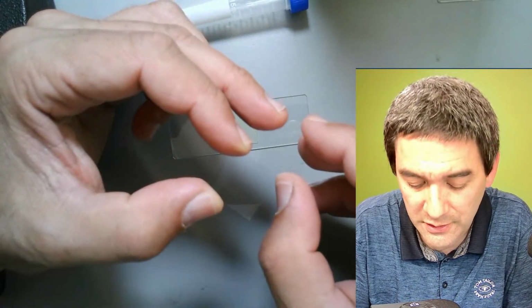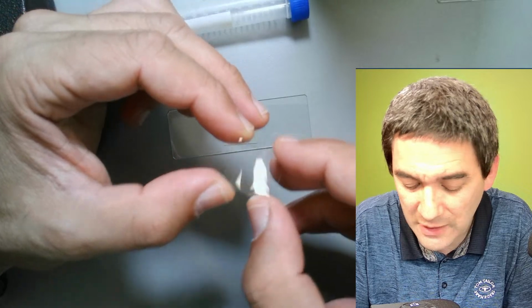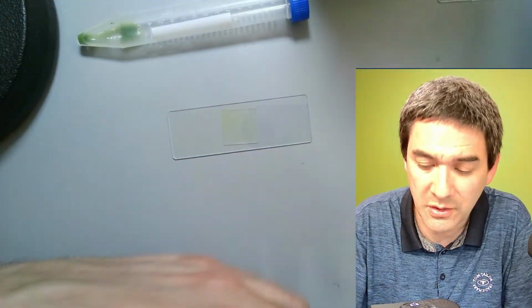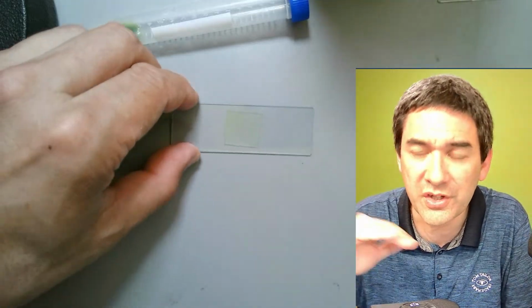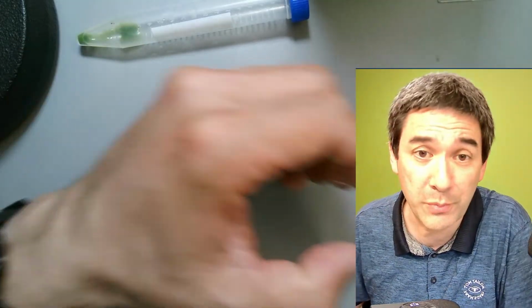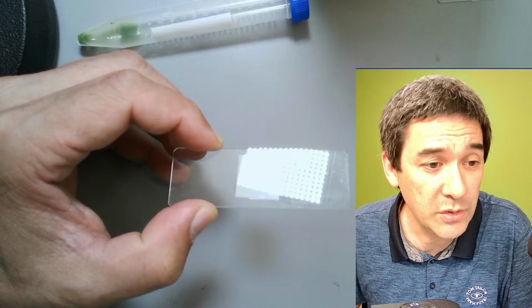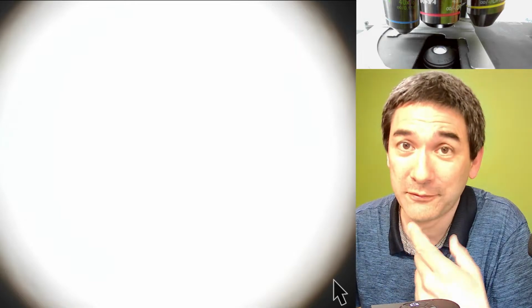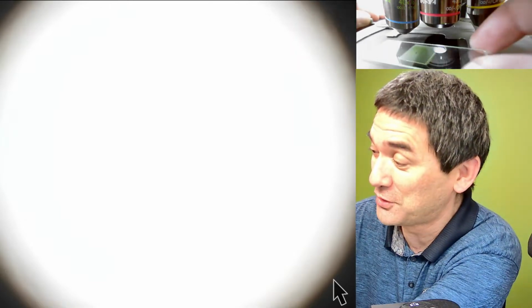Not so much here. But sometimes you actually see that there's a layer of, I think it might be calcium carbonate, because when water was in contact with the glass, it starts to deposit, and then it makes those water spots. So I'm going to put this now here. I have yet to find cover glasses that do not need to be cleaned. Well, only if I wash them first, then of course they're reasonably clean. But unfortunately, so this is how it looks.